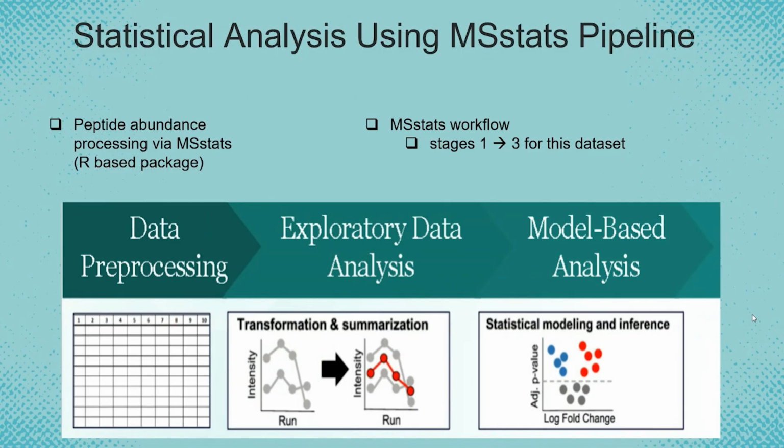MSstats is an R-based package, and there are additional steps, but for this specific contribution, we went through data pre-processing, exploratory data analysis, and model-based analysis. We didn't go into small scale or large scale. We were just trying to understand the actual abundances of the specific proteins in the samples.